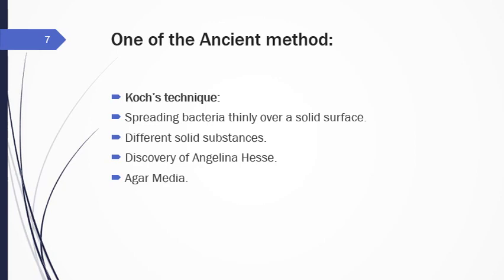Only very few organisms digest agar, and in a 1.5% solution it does not melt below 95 degrees Celsius. Furthermore, after being melted, agar remains in the liquid state until it has cooled to about 40 degrees Celsius, a temperature cool enough to allow the addition of nutrients and living organisms that might be destroyed by heat.